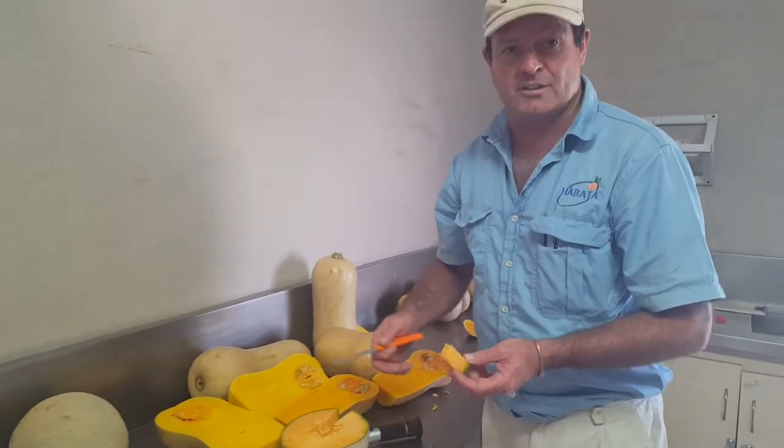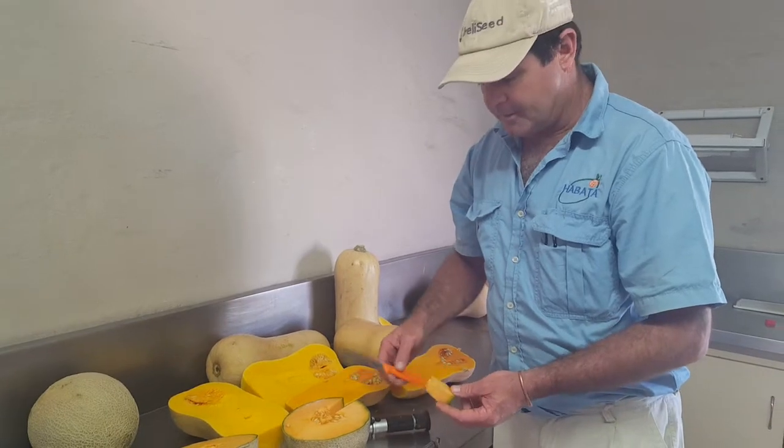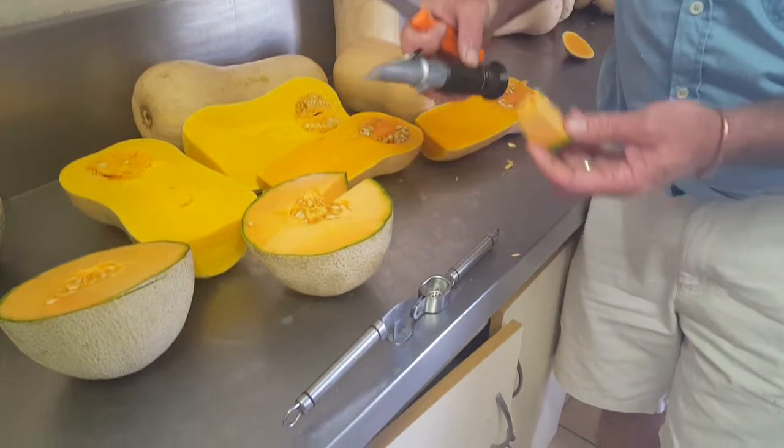Okay, what we are going to do here is measure the brix of a melon — a spanspek. Basically what you need is a knife, a garlic crusher, and a refractometer.